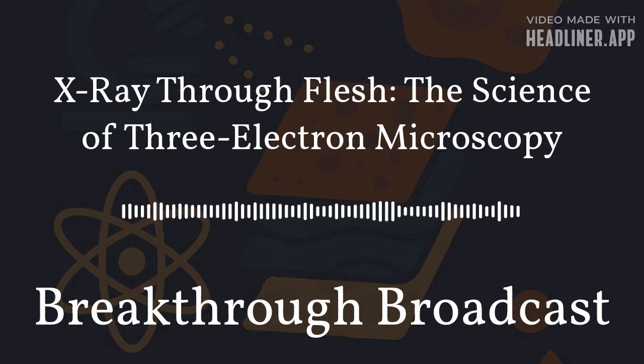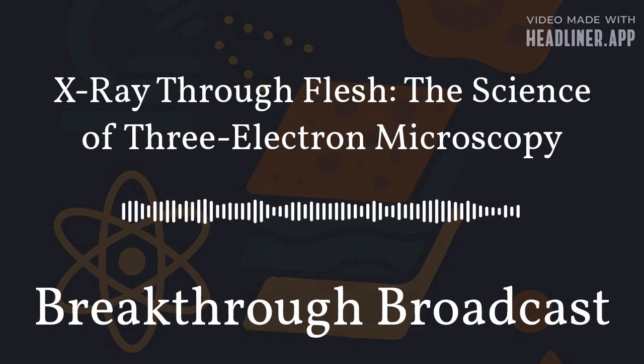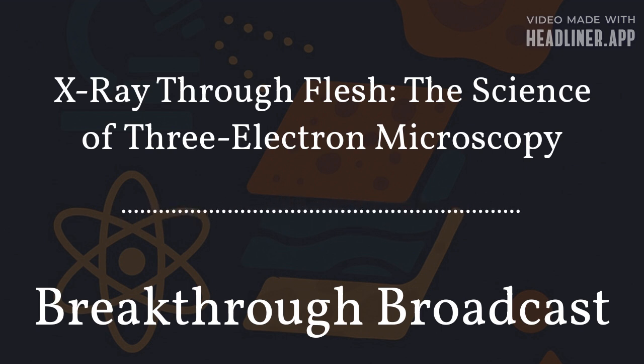Three-electron microscopy also encourages new ways of thinking about biological imaging. Instead of treating surface, density, and internal information as separate datasets, the technique demonstrates the value of integrating complementary signals. This approach may inspire other imaging methods that combine optical, chemical, and physical information. Hybrid technologies that merge electron imaging with other technologies could offer even more detailed pictures of biological complexity.